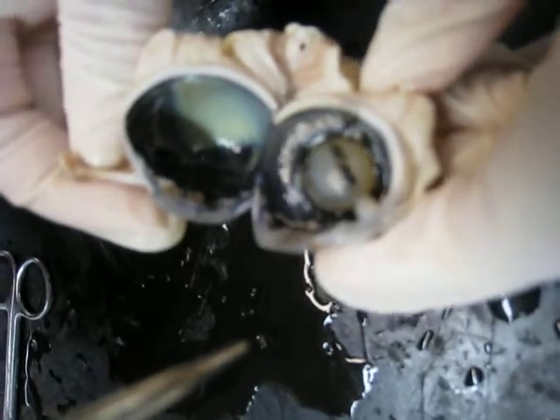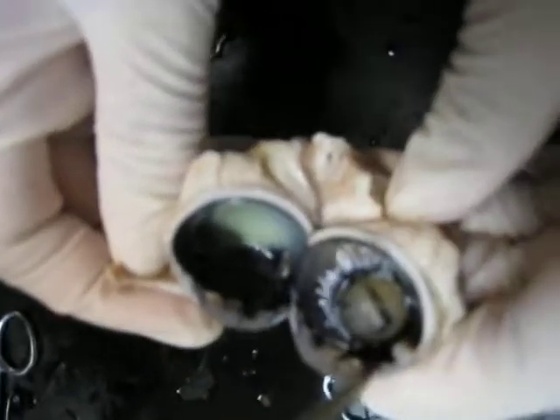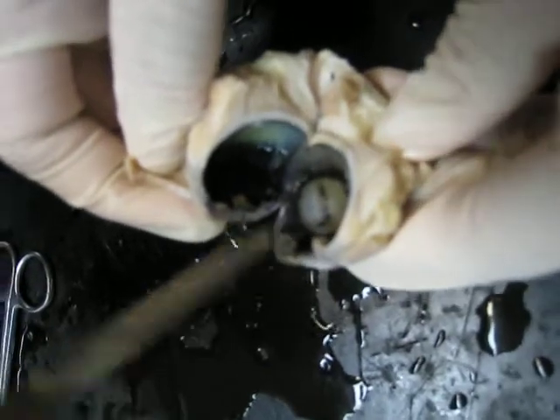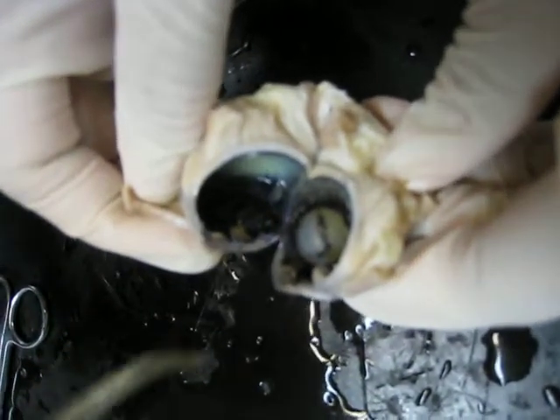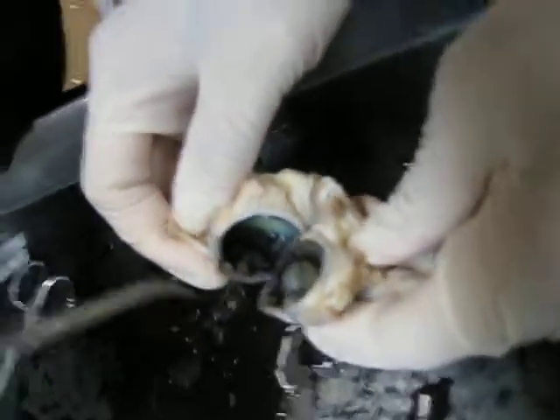That hole is controlled by this body right here. It's like a thick mass, a kind of bulb that sticks out into a structure. That's part of the ciliary body, okay? And it shoots out some of its ciliary processes. You can sort of see it here. See those thin lines? And right at the very tip are the suspensory ligaments, okay?